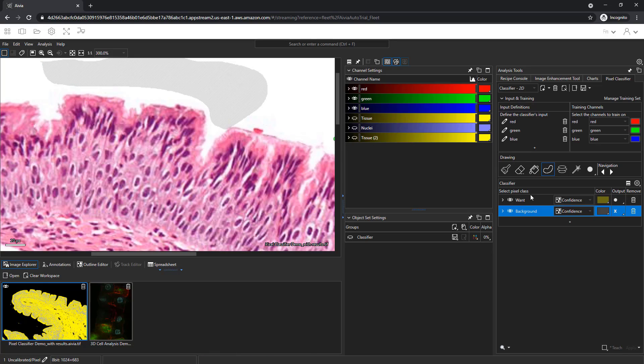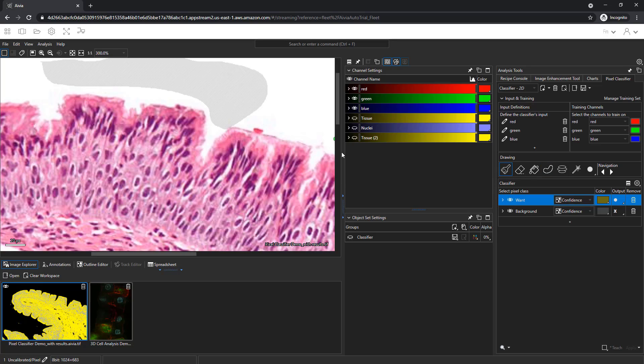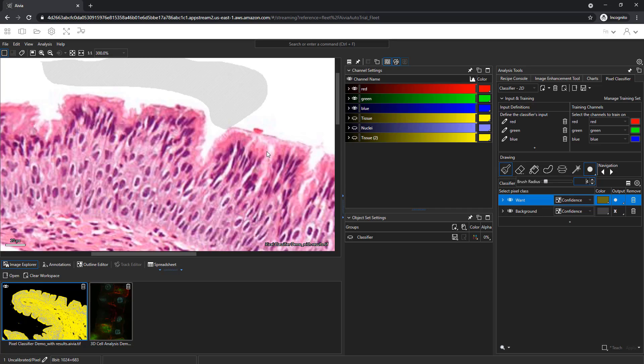Select the want region and the paintbrush tool. The paintbrush has a specific radius, shown as a green circle around the cursor. You can adjust the brush radius from the toolbar or by holding down the ctrl and shift key while you roll up or down with the scroll wheel.